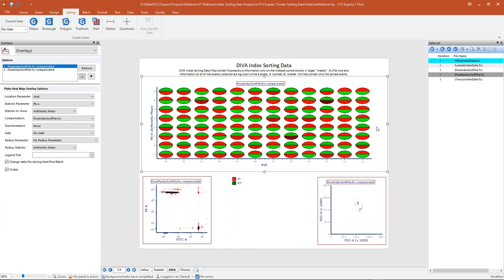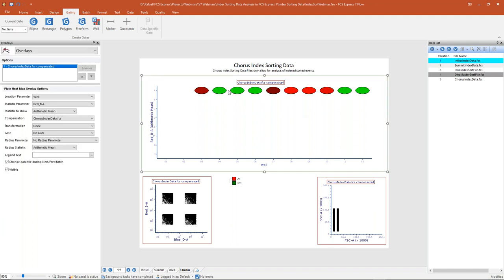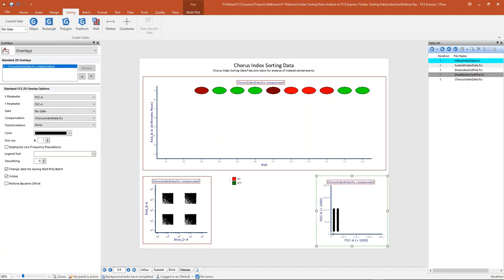For our last example today, we're going to look at Chorus data. The Chorus index sorting data is a little different when you first open it — it contains only the index sorted events. Here I have my plate heat map available, but we've only sorted 10 cells, showing up as 10 different wells. Below the heat map are our dot plots with truncated and perfectly shaped rectangles. To work around these shapes, we're going to start gating on our sorted data so we can look at the populations we care about.